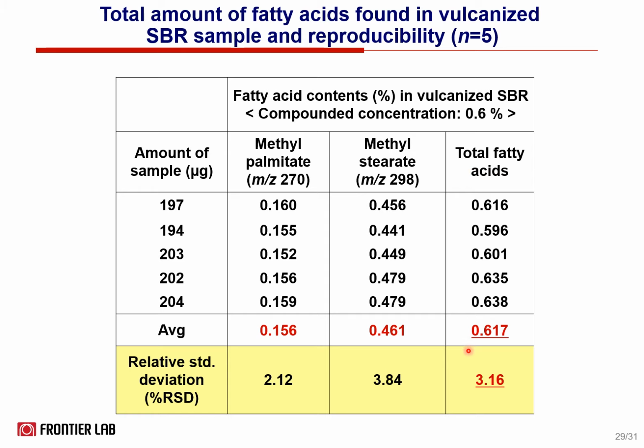As a result, the total fatty acid in the sample was found to be 0.617%. The reproducibility of the results was good, with RSD of 3.16%.